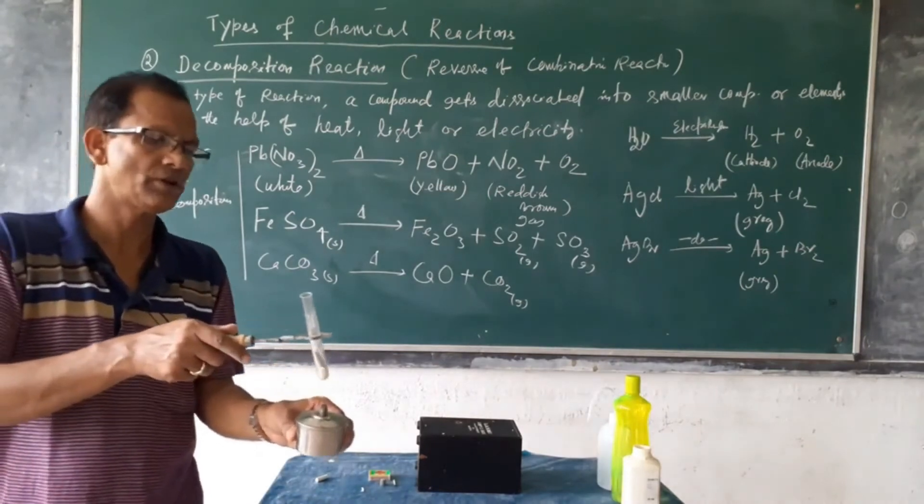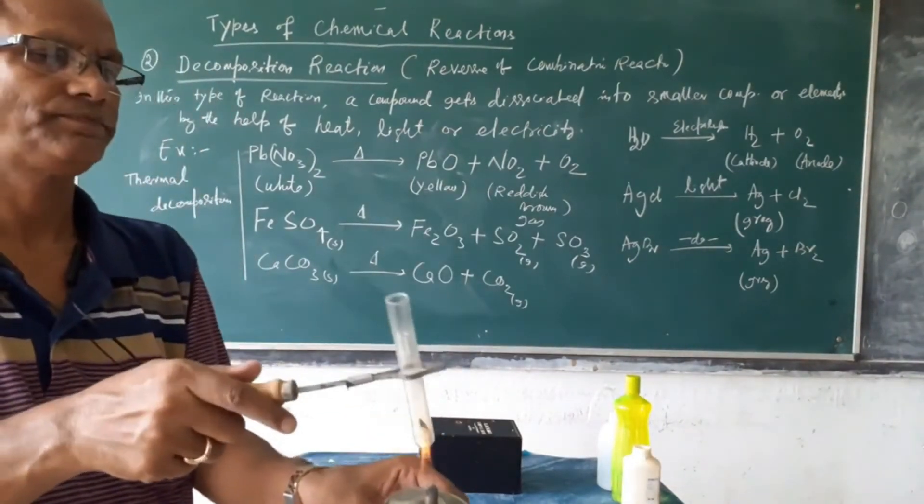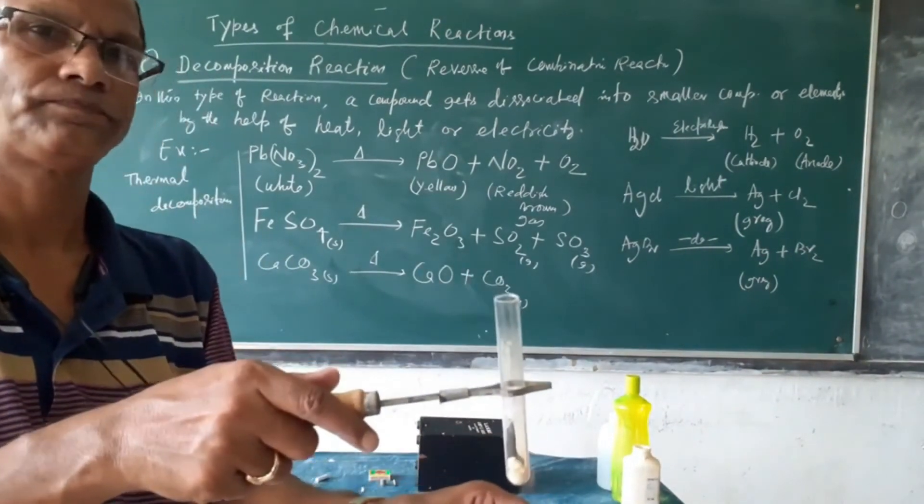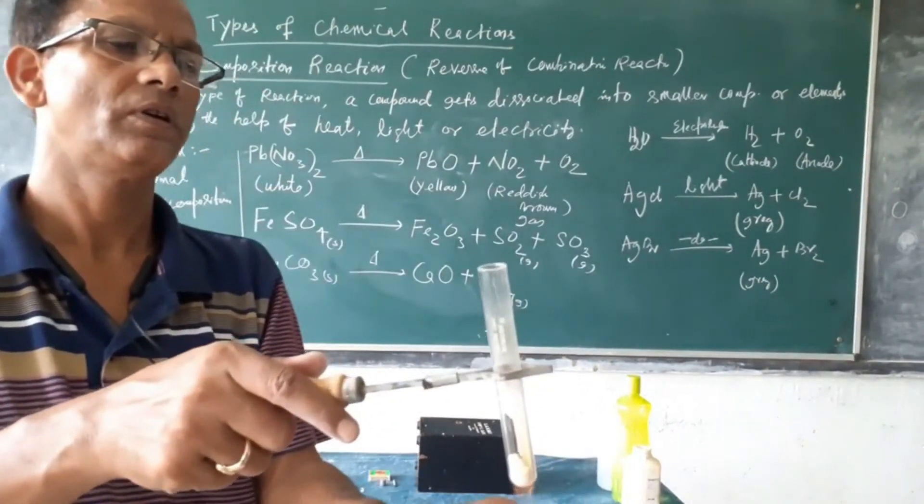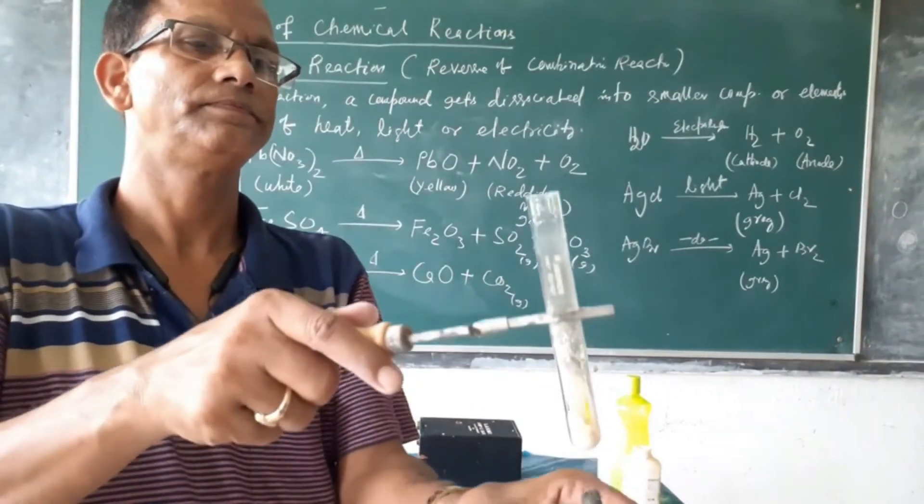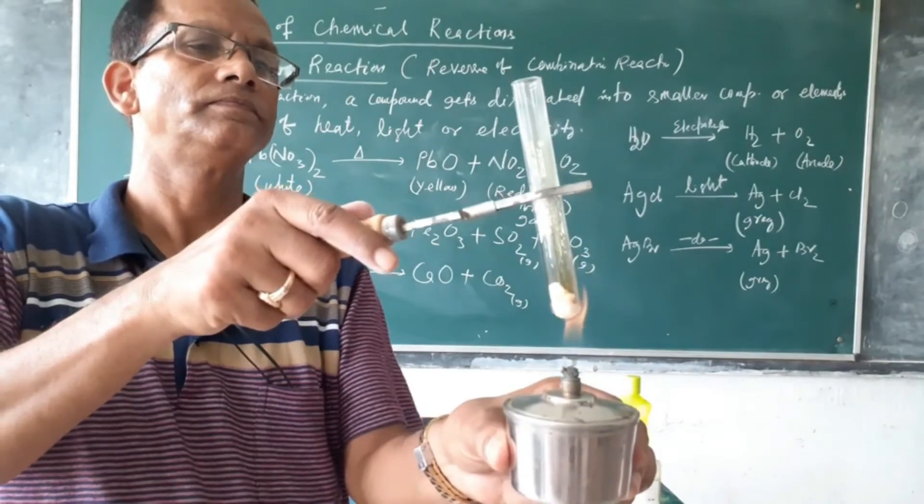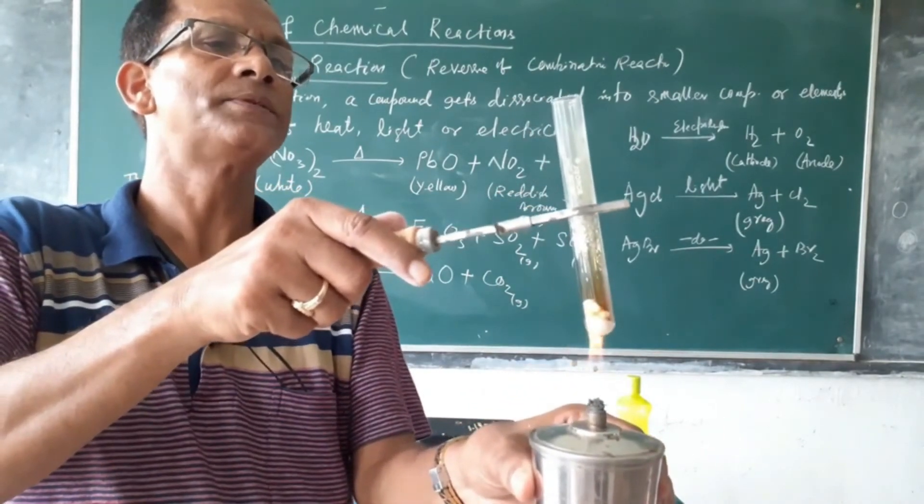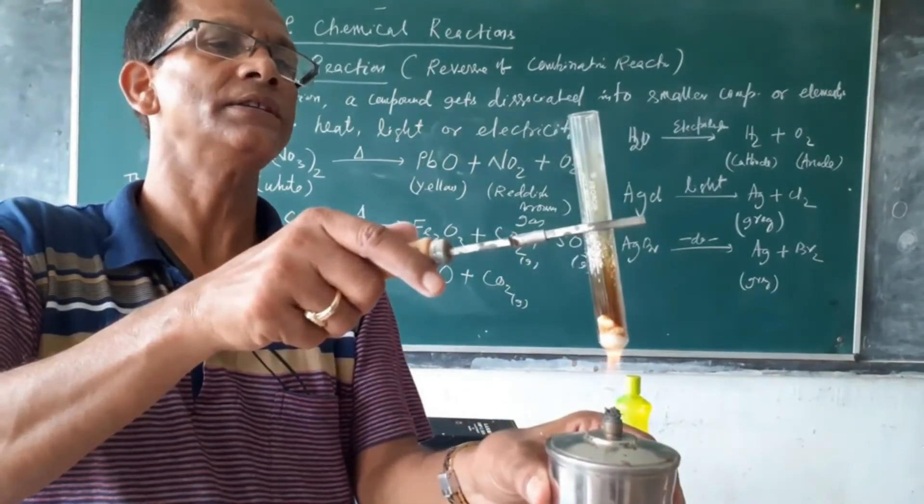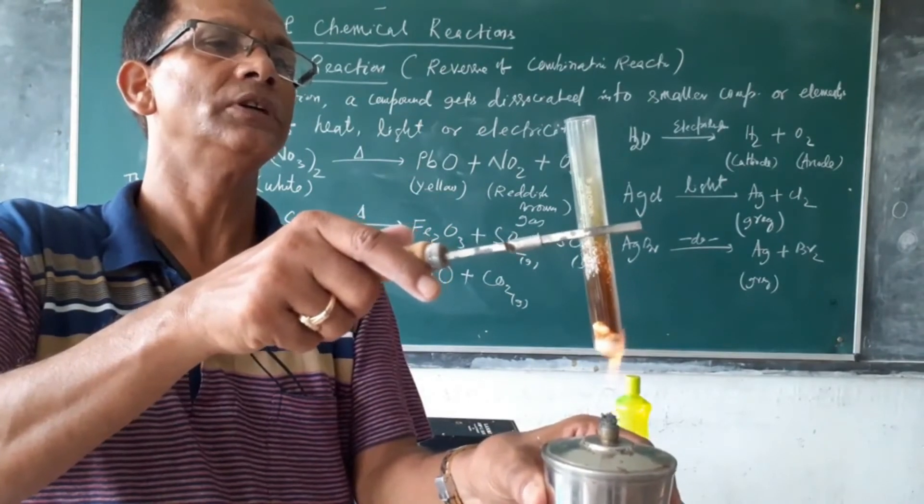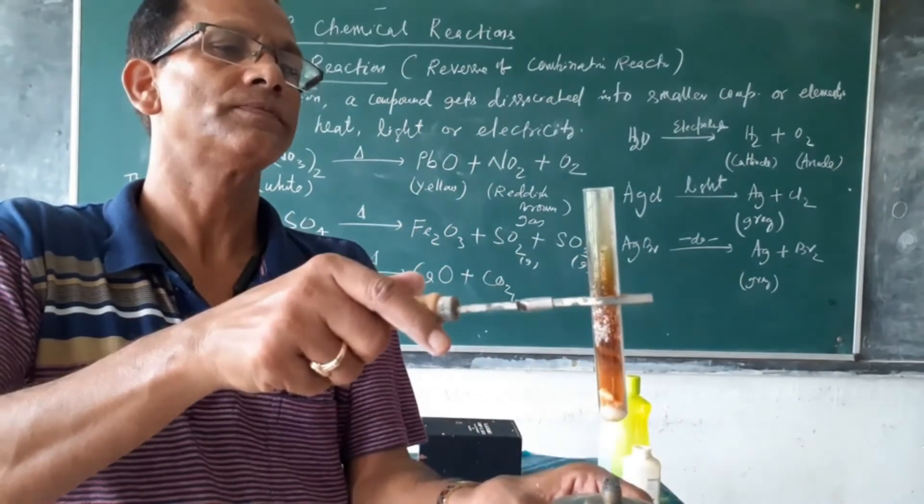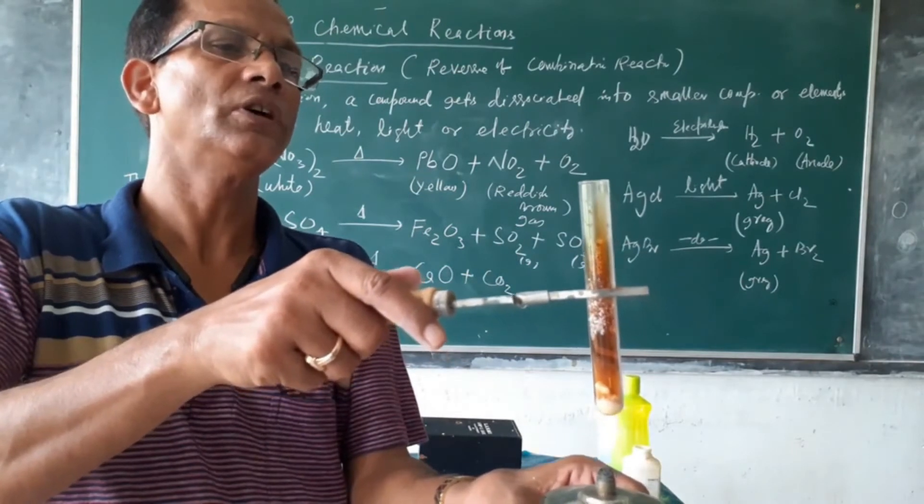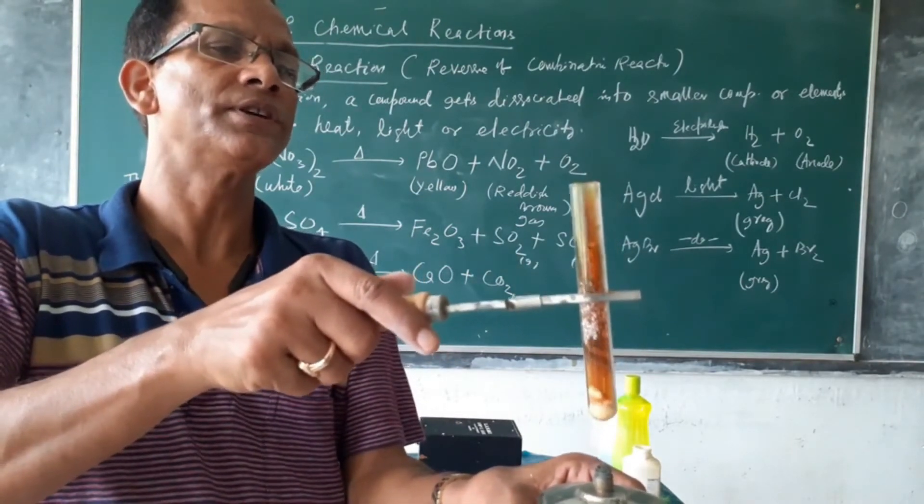You see. Now you see the observation. It is producing reddish fuse. Just you see the inner side of the test tube.